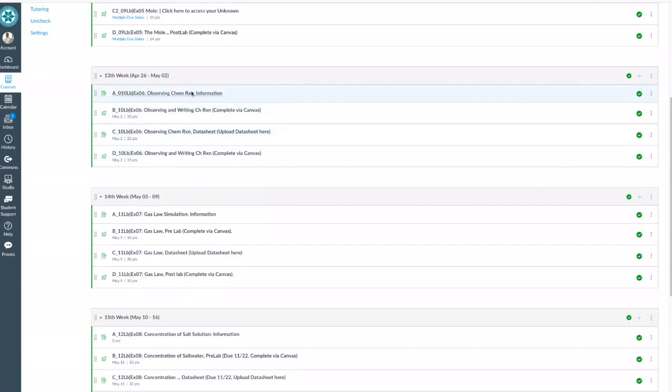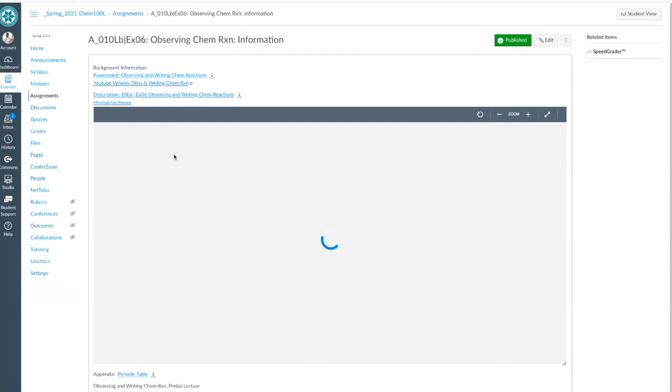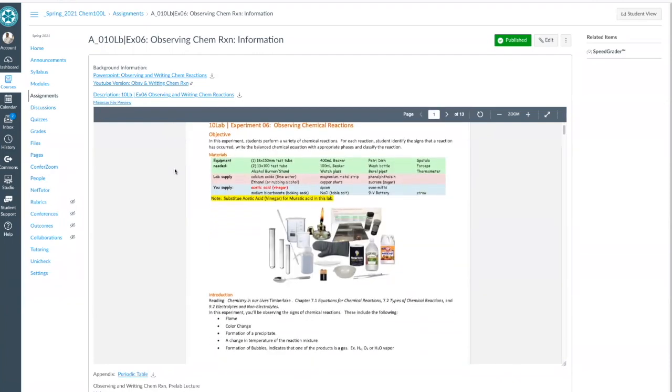This, of course, the A part just gives you the information. You can watch these videos. That was taken when this experiment was conducted at Miramar College. I will also go over the PowerPoint, and the YouTube discussion from, I think, the previous semester, and a description of the experiment. And if you click on that, this is the description of the experiment.